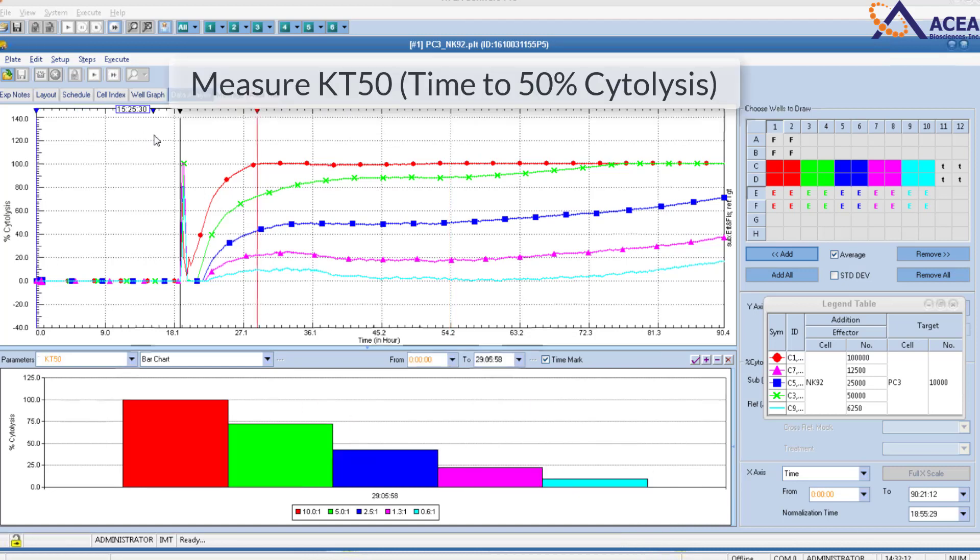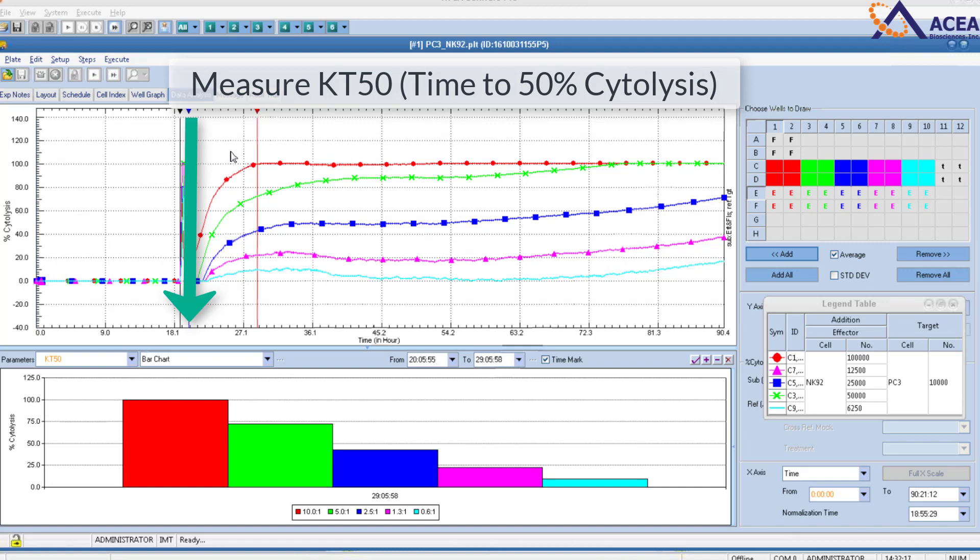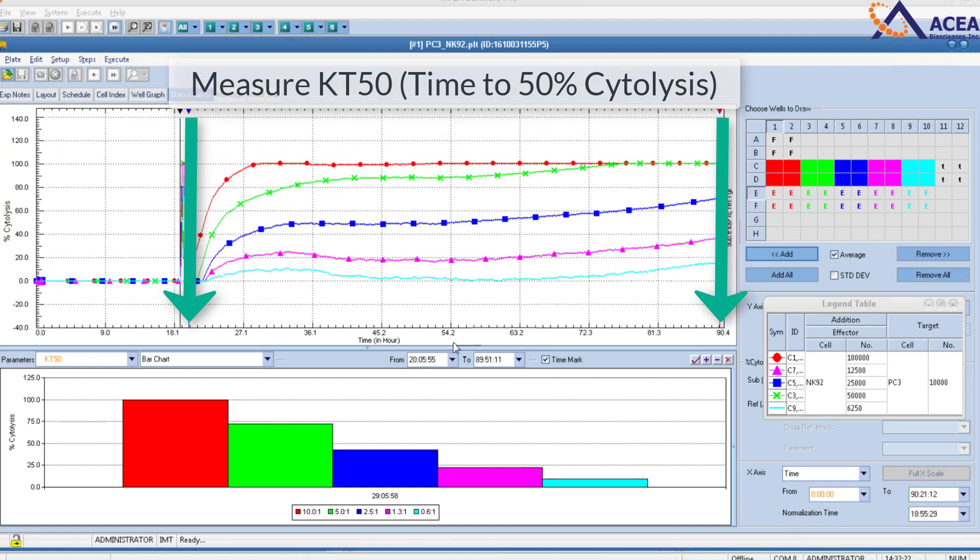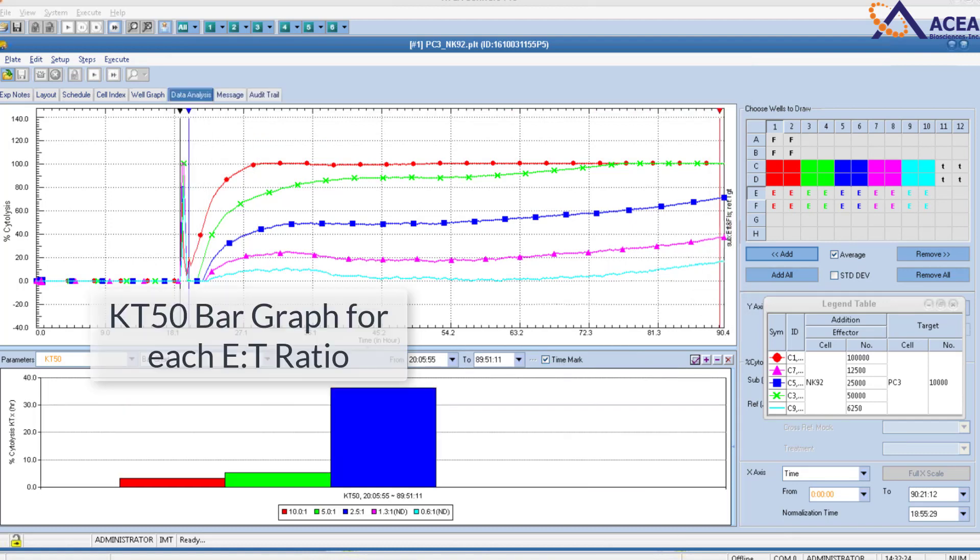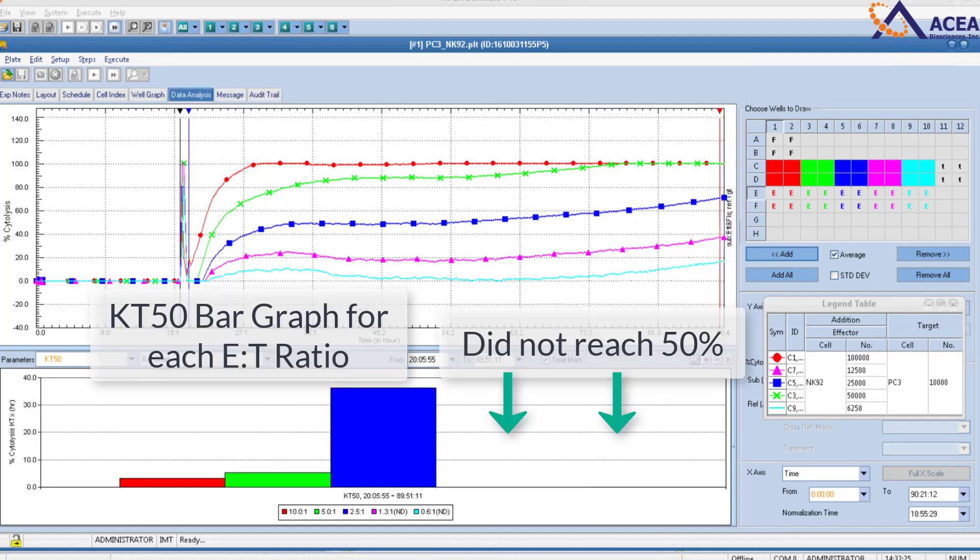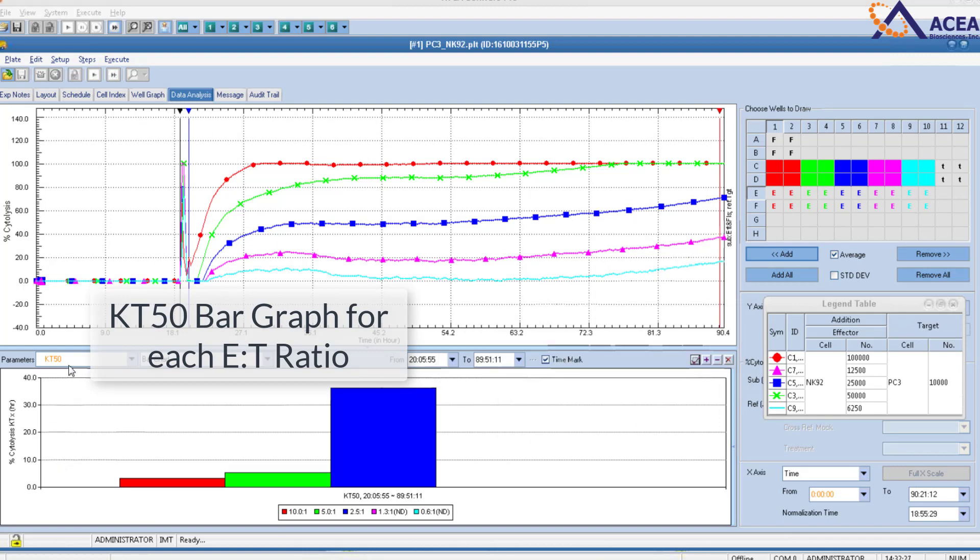To measure KT50, which is time to 50% cytolysis, drag the time markers to measure between effector addition and your last time point. You can also create KT50 bar graphs for each E to T ratio.